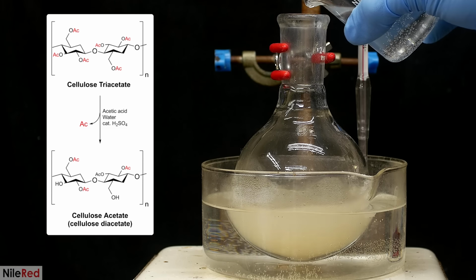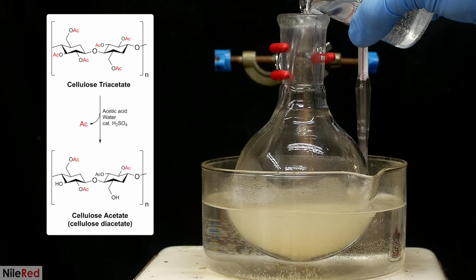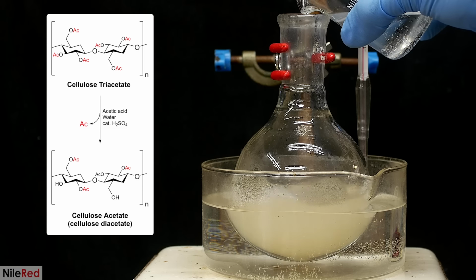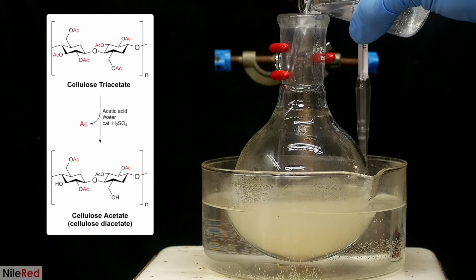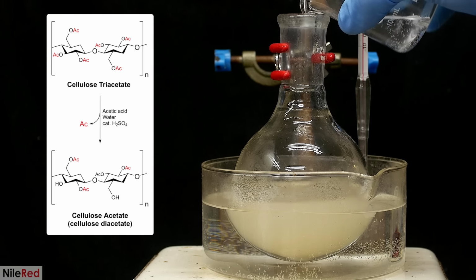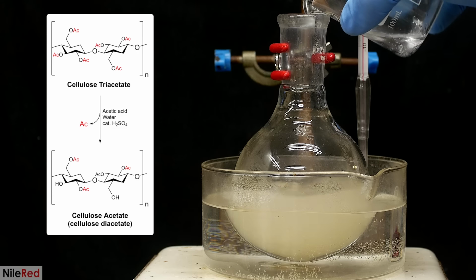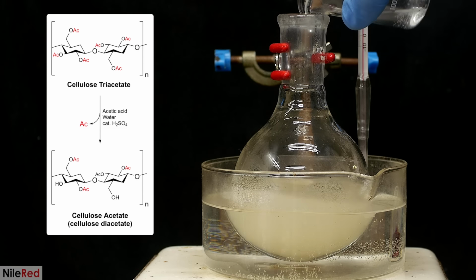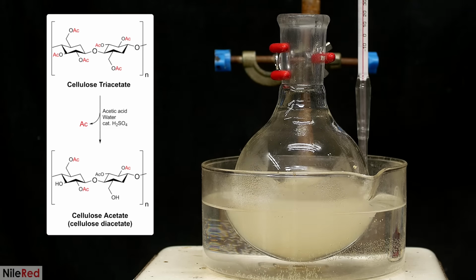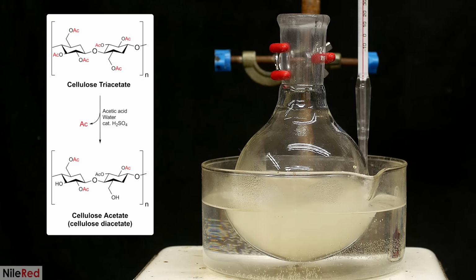By adding water here as well as sulfuric acid, I'm going to be hydrolyzing some of the acetyl groups and converting them back to hydroxyls. I'm going to run it under these conditions for about 3 hours, which should on average remove one acetyl group for every glucose unit. So the major product I'll be making is cellulose diacetate, but I'm sure some triacetate will remain unaffected, and I might also form some monoacetate.